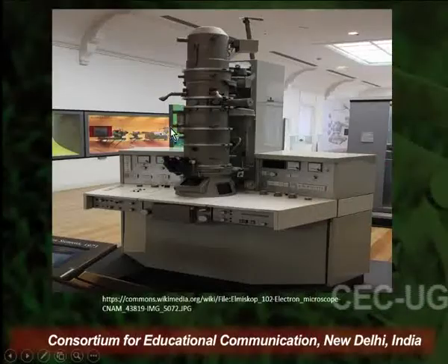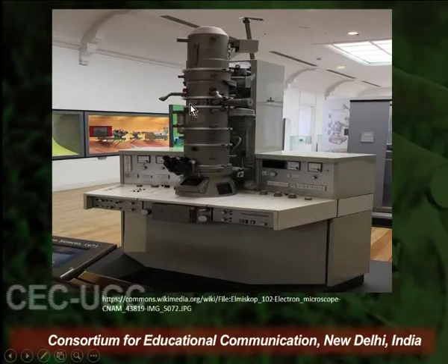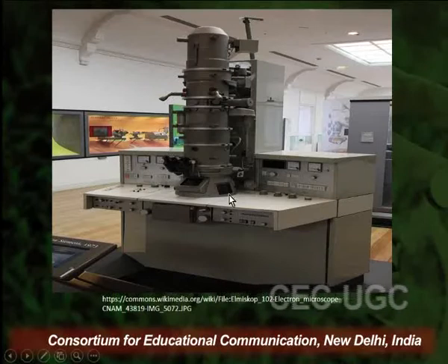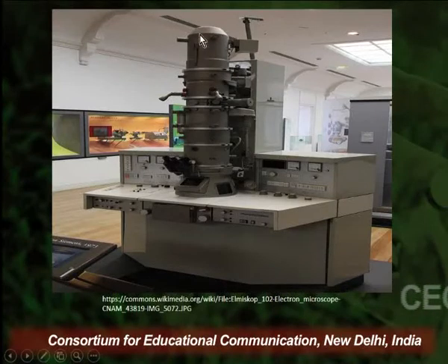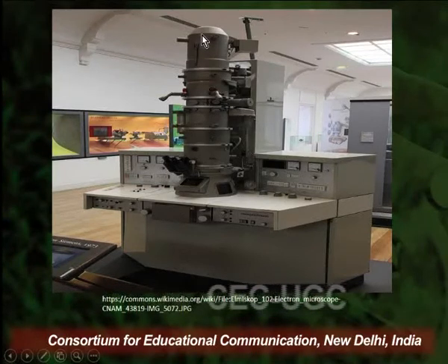So here is a picture of a very retro model of an electron microscope. It looks very massive and very complicated because the entire functioning depends on multiple factors which we would be seeing in our lectures to come.